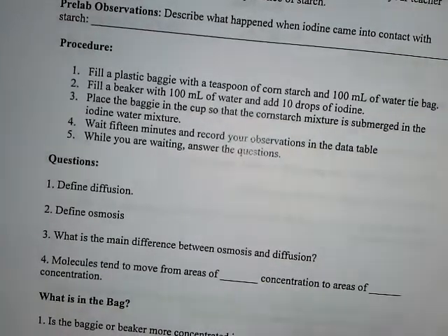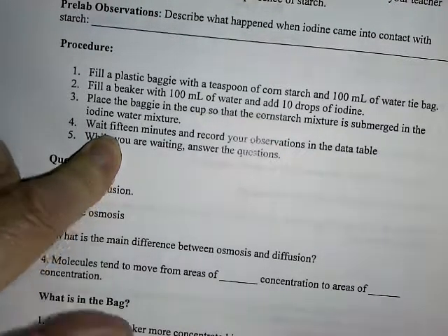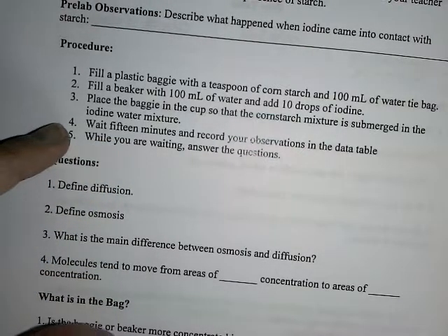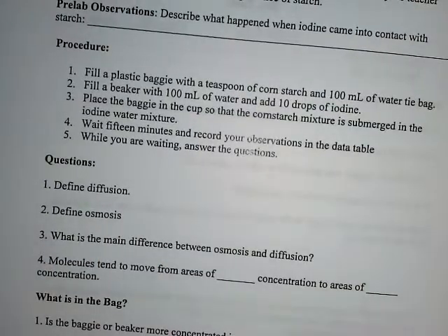On the side cupboards, you're going to notice that there are beakers, baggies, and cornstarch. I think that's all you need. You're going to need your phones. If you don't have your phones, you can use the iPad or just use the clock on the wall to measure 15 minutes because you're going to need to make some observations after 15 minutes. While you're waiting for those observations, though, you can fill in some of the questions that are here.